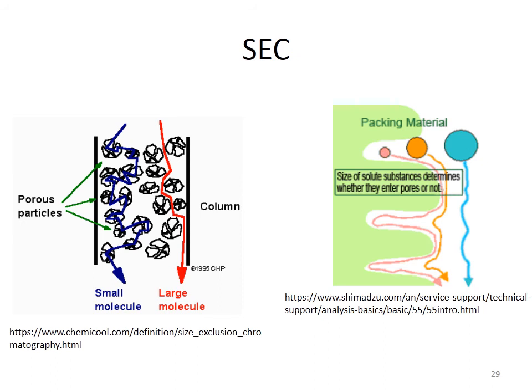There are different types of chromatography beads available with different types of pore sizes. So depending upon the type of the protein which is to be separated, we can select a suitable type of the stationary phase having suitable pore size.